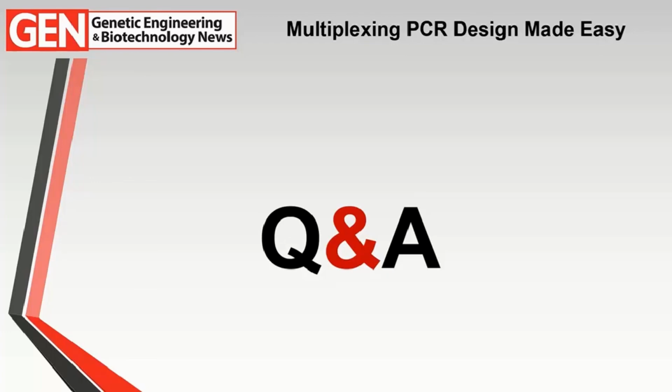But on the lab-on-a-chip, at least what we have experience with, generally the transfer that we did from a benchtop instrument to the lab on a chip was pretty successful. The only thing that we had to be very careful about was obviously any kind of inhibition that happens in a lab on a chip platform, and that's generally materials and surfaces, surface to volume ratio. Another very important thing was the temperature profile in some of the assays, depending on what kind of structure your amplicons have, which has a direct effect on the efficiency. So meaning your ramp rates and exact temperatures, especially for the denaturing.